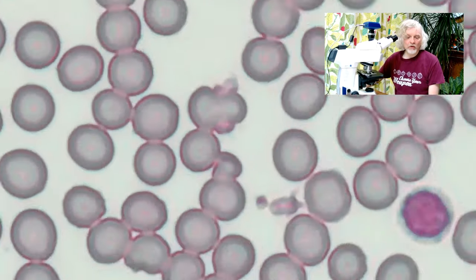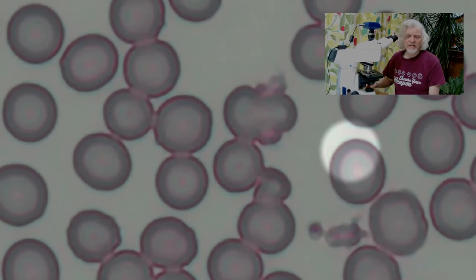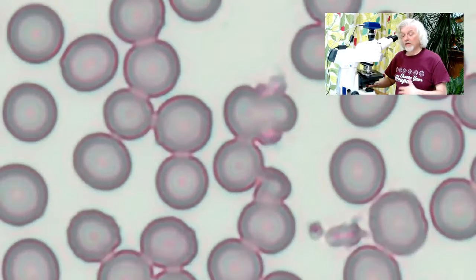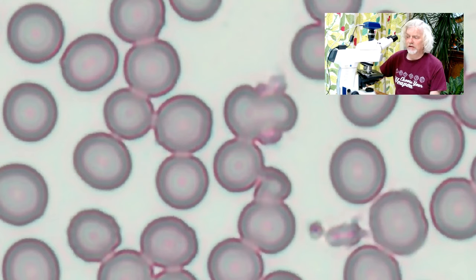If I zoom in on some of the blood cells there, you can see there's the thicker bit, and then there's the thinner bit on the inside. The thinner bit is stained less dark than the outside. But there are other things to be seen on this.